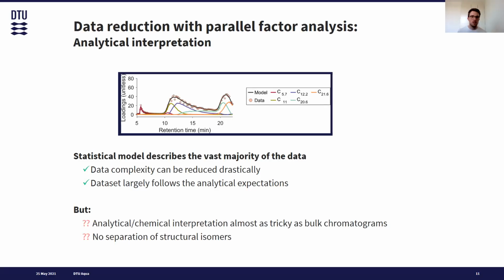So overall, I'd say that this model was fairly good at reducing the complexity of our data set drastically. So millions of data points were reduced to 5 components. So that makes it much, much easier to interpret a large data set like the one that we had here.